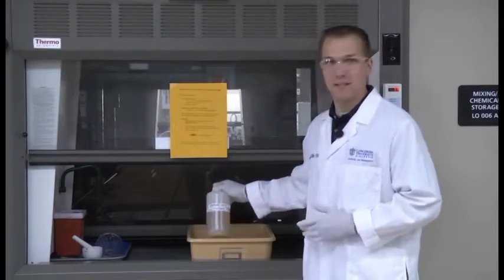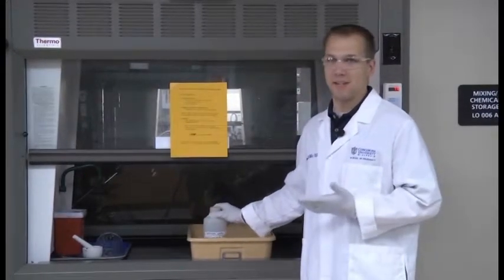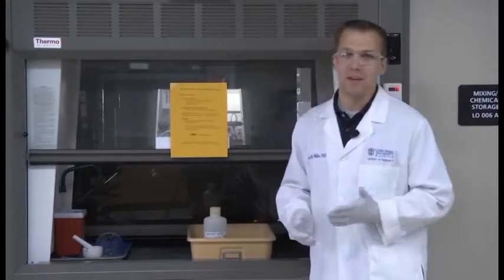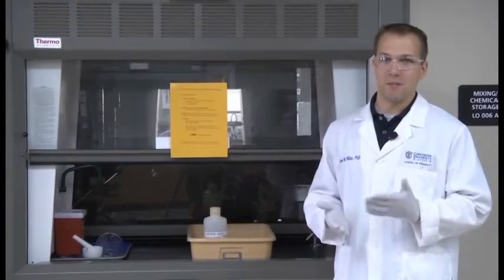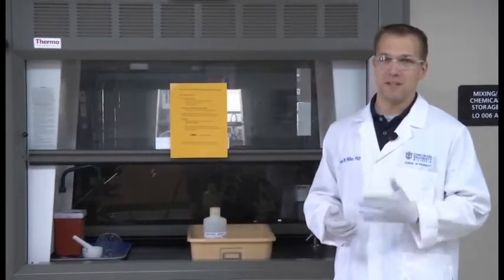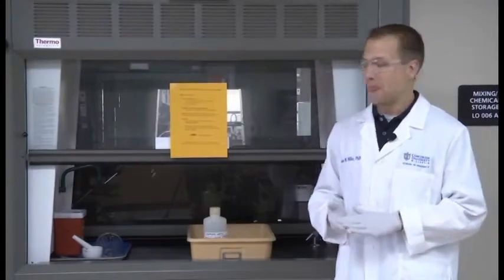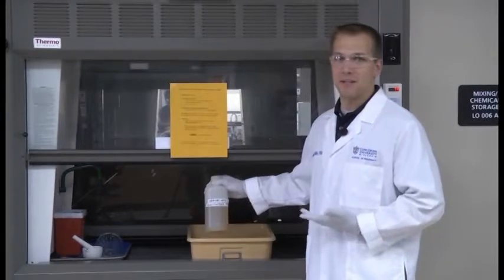The other things that this container needs are proper labeling. We always need to know what's inside this container. So you should have the full chemical name of the contents of the container. We want to know how long this container's been around, so you need to have the accumulation start date, or the date that you start adding material to that container. And you also need the words hazardous waste to be included on that container so that we know that it's hazardous waste.